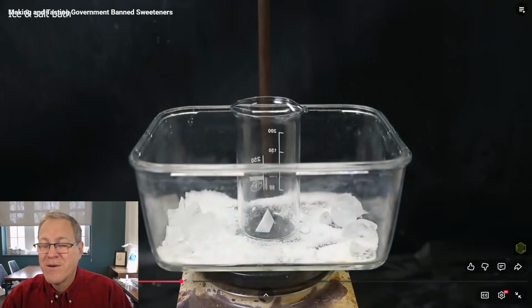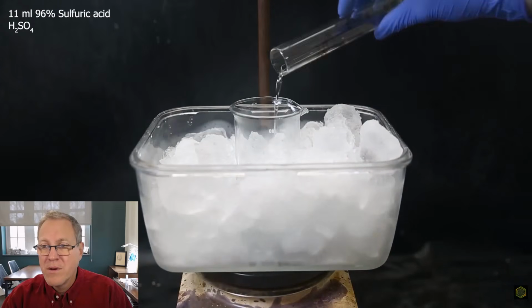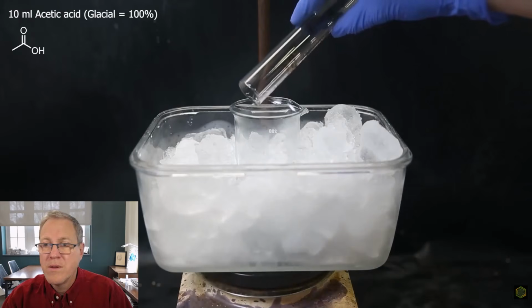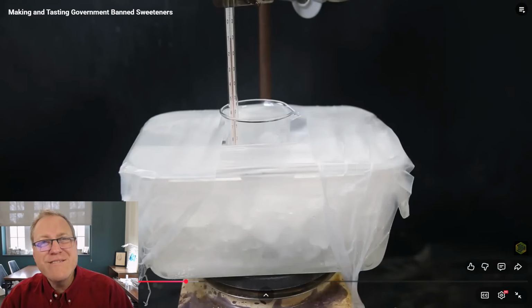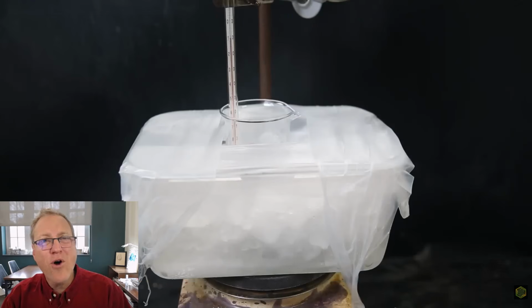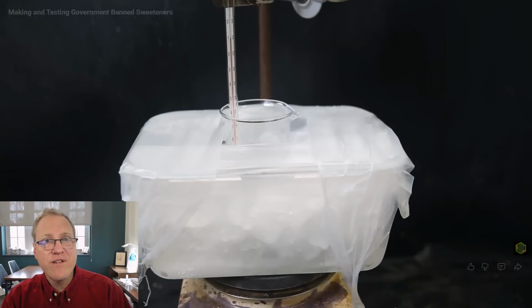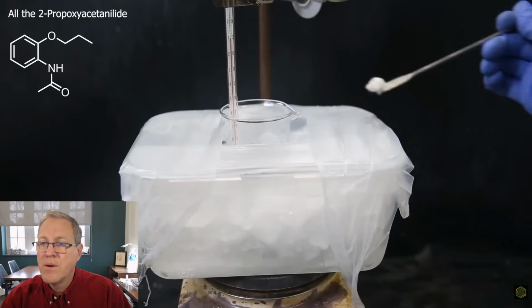Fill the dish with a mixture of ice and salt, which will make it extra cold, and reach to about minus 20 C. Then to the beaker, I first add 11 ml of 96% sulfuric acid, and then 10 ml of glacial acetic acid. I then leave that to cool down to minus 10 C. So minus 10 degrees Celsius with that ice salt bath. That's frigid. So he's apparently sensitive to the temperature. He wants this to be a very cold reaction.